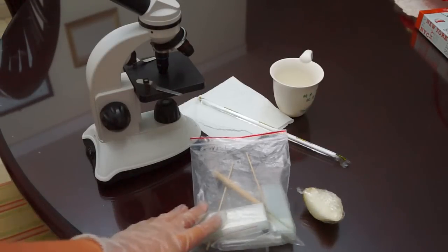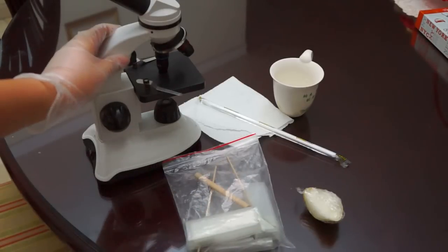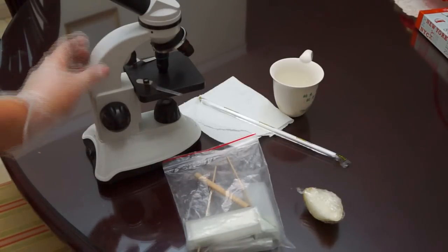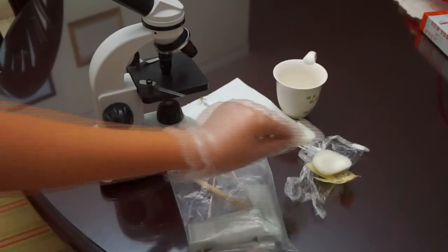For this experiment we need an onion, tools such as cover slips and slides, a microscope to make our experiment, towels, straw or dropper and water.